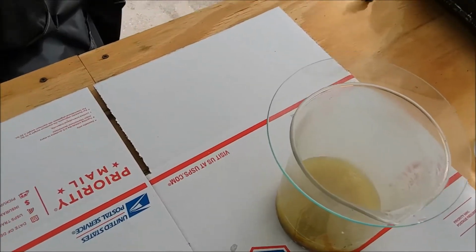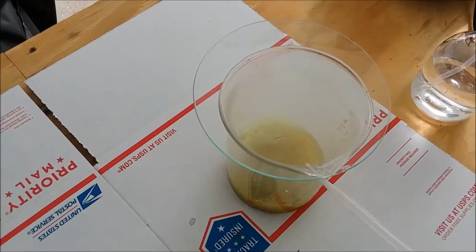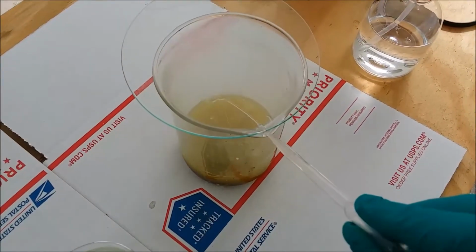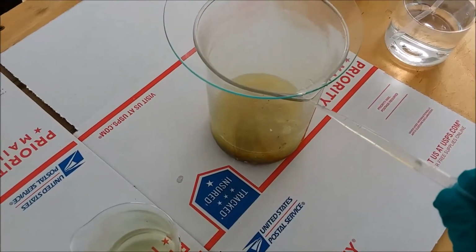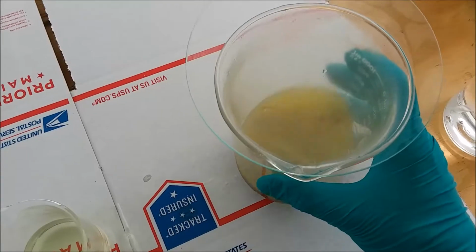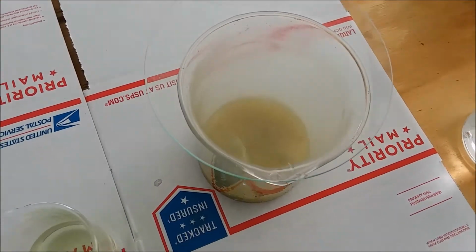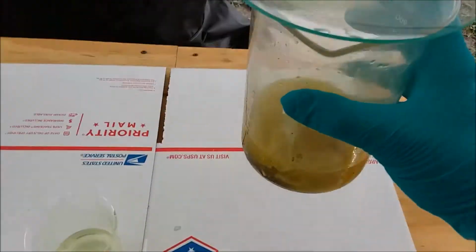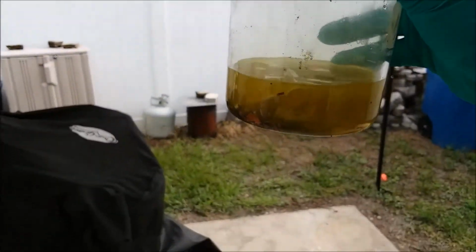1, 2, 3, 4. So swirl that around some. If I've been keeping track, I guess that's about 18 milliliters of bleach total so far. If my count is accurate, I'll have to look at the video and see. So I'll just let this sit some more.